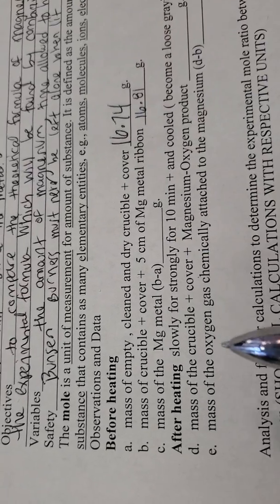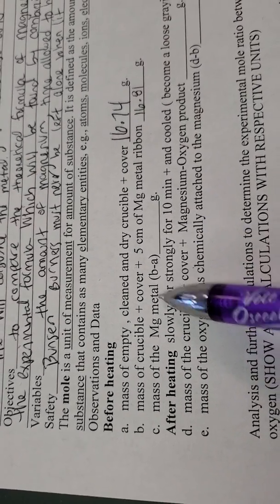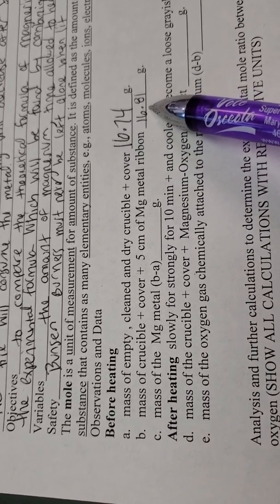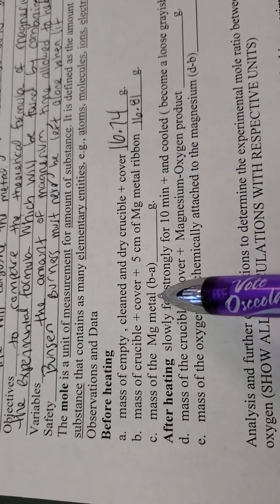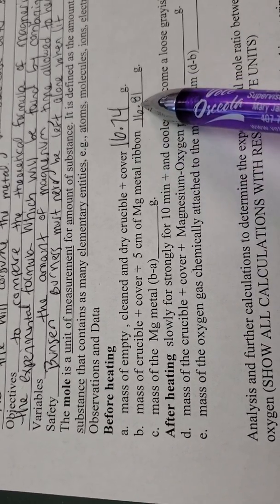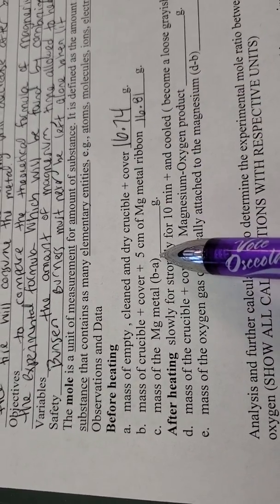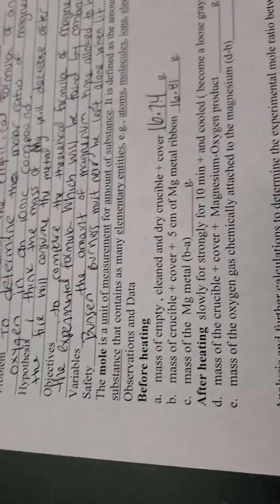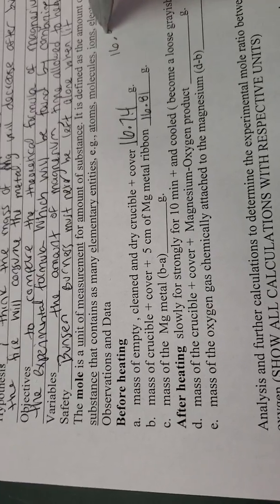All right, well now I need to find the mass of just the metal. Well, this is the mass of the empty crucible, and then this is the crucible plus the metal. If I want just the metal, all I have to do is take away the crucible. Whatever's left is the metal. So 16.81 minus 16.74. Let's see what I get.